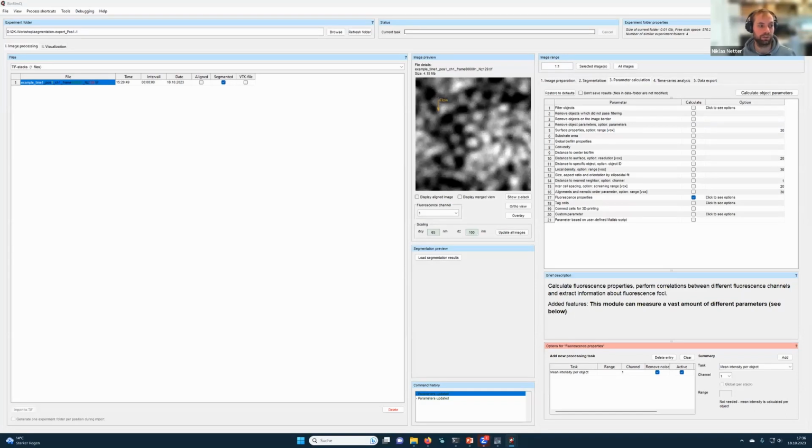Hafiz, could you elaborate on your question a little bit? Hi, yes. Because you showed at the beginning that you do the segmentation with Napari and StarDist, because I do not currently have it with me on the PC. But you showed that at the end you do somehow resegment. Did you resegment it again, or you just want to show that BiofilmQ can do similar segmentation?